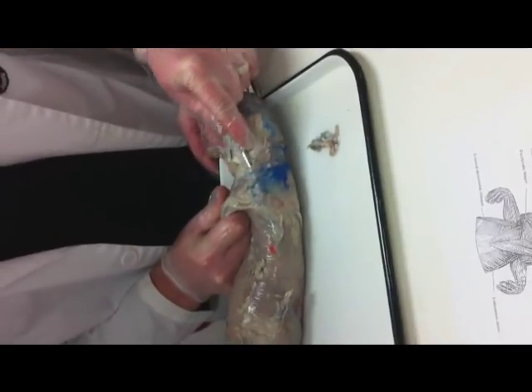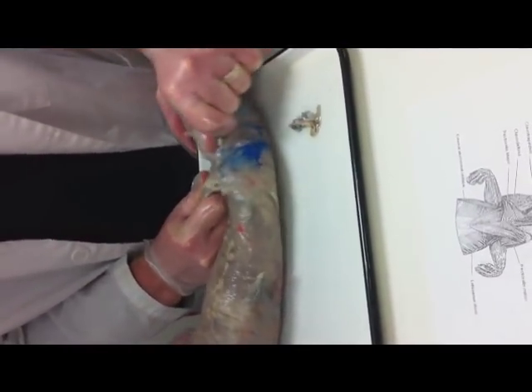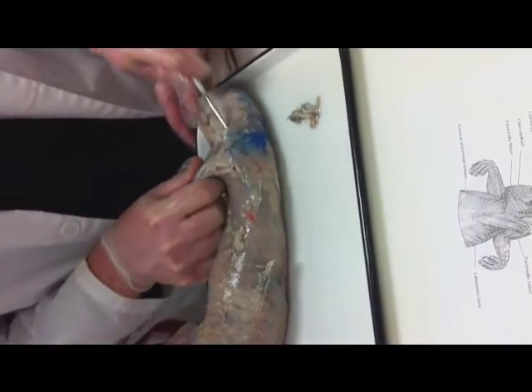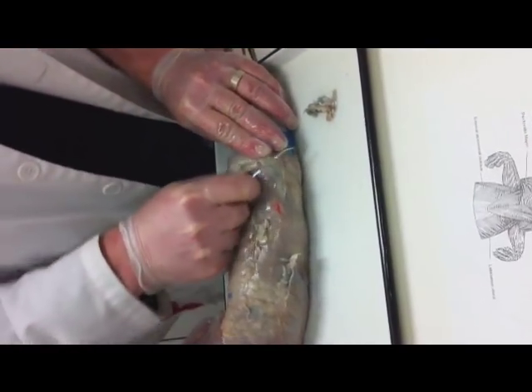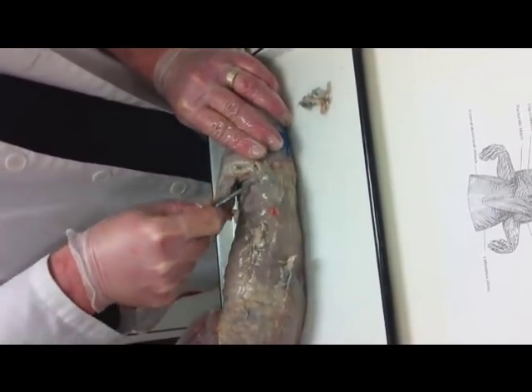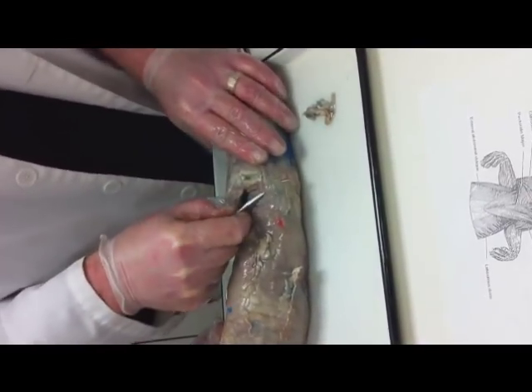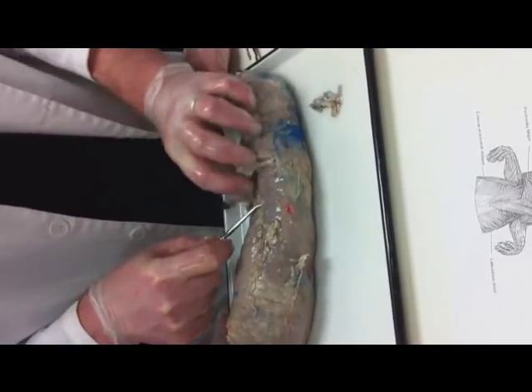This very thin muscle here would be the acromotrapezius. See it? Okay, that big sheet, triangular shape. And then over here, we would have the spinotrapezius, just right there. Now, I'm poking in where I see those line divisions, the fuzzy areas between the muscles. So what I've got is the spinotrapezius, the acromotrapezius, the clavotrapezius.